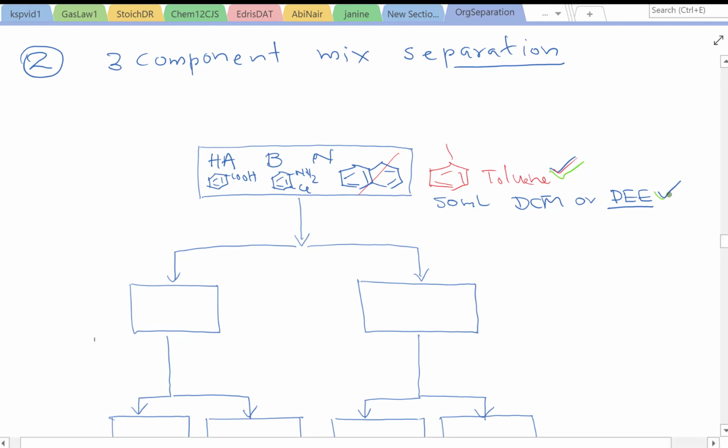So we're going to do the flowchart, like I said. You keep two, one blank, one already with the information you need, the way I'm doing now. And the first step: 3 times 15 milliliters of dilute sodium hydroxide extraction, separating the aqueous and organic layers using the sep funnel with the normal methodology.